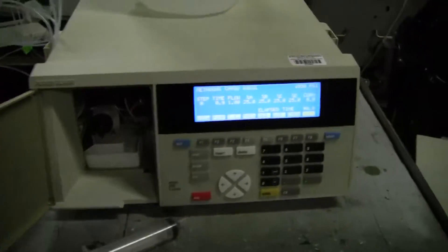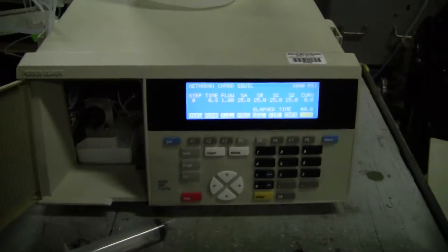Hi, this is Michael from Hitech Trader. Today we're looking at a Perkin Elmer 200 quaternary pump.